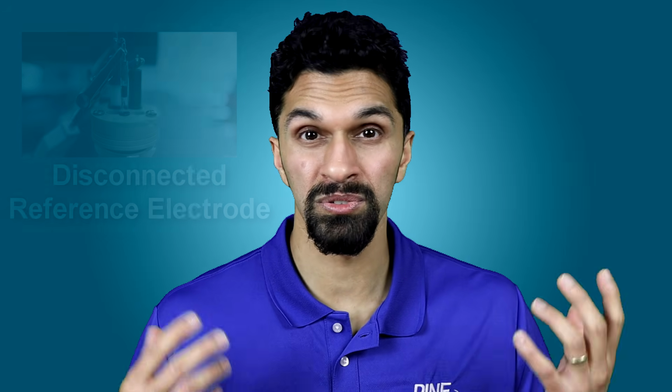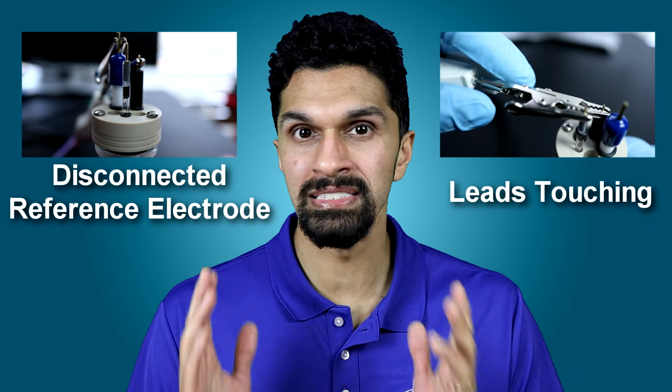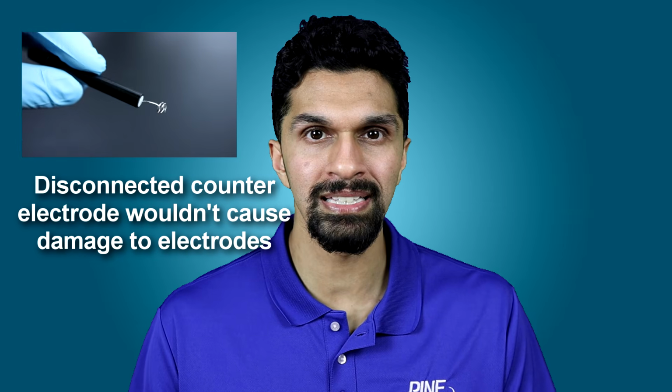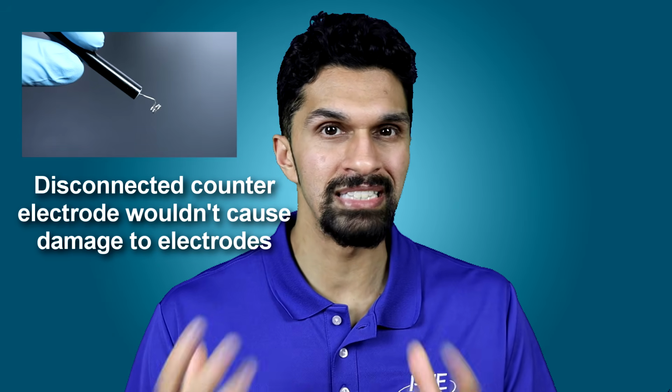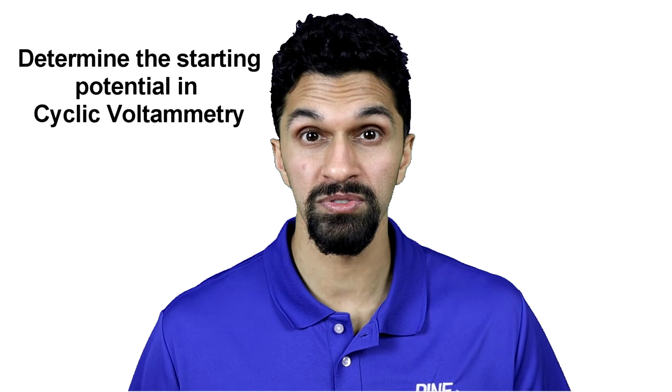If I forgot to connect the reference electrode, or some of my electrode leads were touching, there's a good chance that I could damage some of my electrodes. If the counter electrode lead was disconnected and I tried to run a cyclic voltammetry experiment, I wouldn't run the risk of necessarily damaging any of my electrodes. So that was one practical reason to perform an open circuit potential experiment prior to doing something like a cyclic voltammetry experiment. The other useful bit of information for taking the open circuit potential is to determine the starting potential of your cyclic voltammetry experiment.